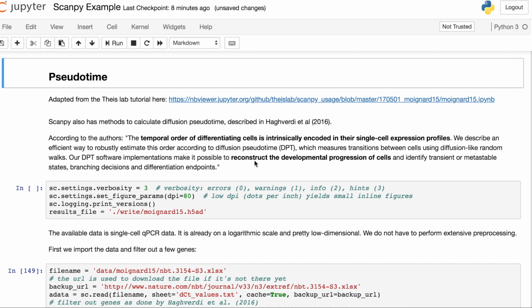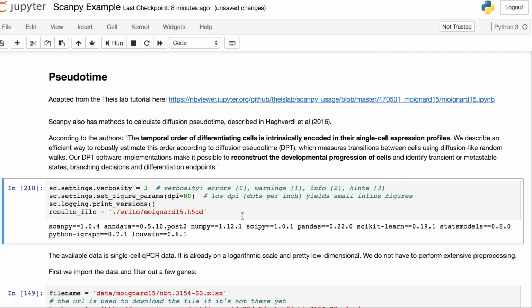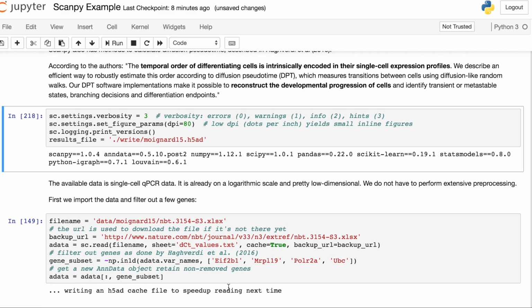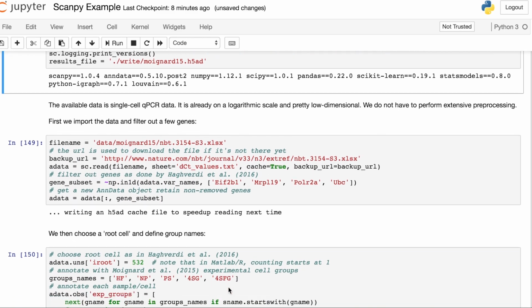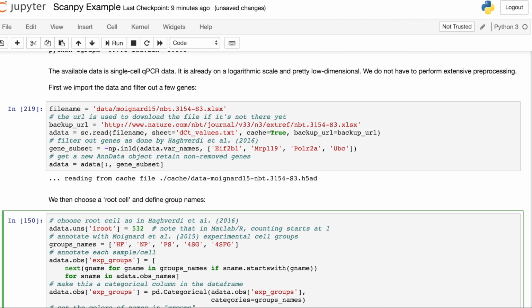And if you haven't heard much about diffusion pseudotime before, I really encourage you to look into it. There are a lot of alternative competing approaches available from other labs as well that have come out in 2017 and 2018, and I'm sure will continue to come out because ordering cells along developmental trajectories is an outstanding problem in the field and is certainly of interest, since currently single-cell RNA sequencing methods are destructive and it's not possible to experimentally view a single cell as it's developing, but rather it's of interest to computationally order these trajectories from populations of cells when the populations are at different stages.